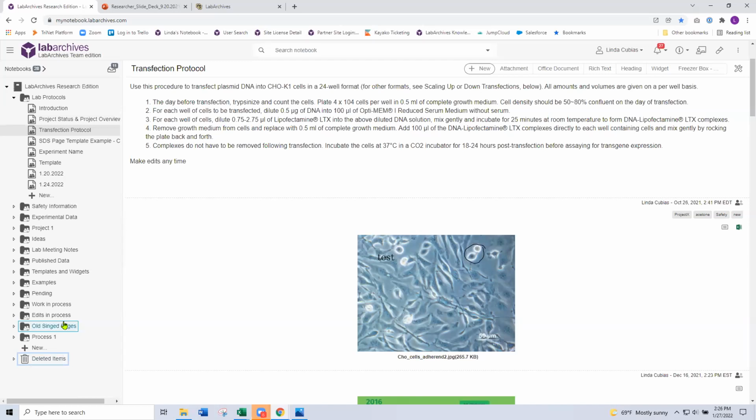Now, when it comes to the structure of your notebook, this is flexible, but just to get the structure started, all you really do is point and click at that New plus New button, where you'll add a new folder, add a new page. Also important is the fact that you have the ability to copy content. This is important because maybe as a team, you may decide to create a notebook that stores your protocols. Maybe that's going to store your templates, and it's all reusable materials for you to use in LabArchives. I can reuse that without having to create that content over again from scratch.